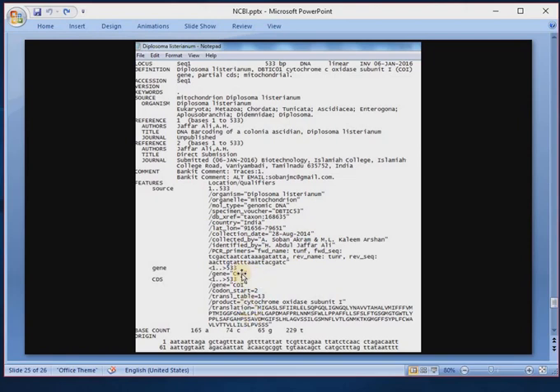Then our nucleotide sequences are translated into amino acid sequences. I told you in the third step. So here these are the amino acid sequences of the nucleotide. Okay. So if there is no correction, you just click submit. So your submission is over.